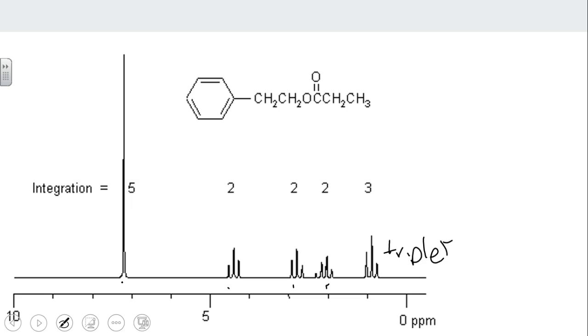And again, when you're doing this in lab, typically you have a structure that you know that you're trying to make. It's not some willy-nilly pick one of a billion structures. You can assume it's either going to be the reactants, one of the reactants, or the target product. So you can really narrow down what you have when you're doing this in the lab.